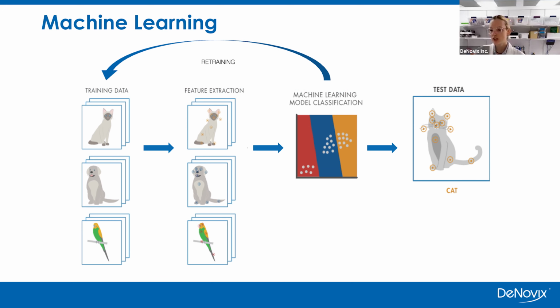In this slide example, machine learning was used to identify different features to allow for the classification of whether or not it is a cat, dog, or bird. For us, our algorithm model is looking for specific features for organoid, dissociated objects, or debris. And this is a respected method, as machine learning is used for a variety of image-based applications out there.